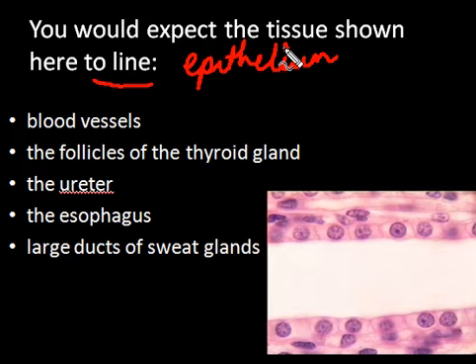You will be given questions. Most of the questions will say identify the type of epithelium seen here, or identify the type of connective tissue or cartilage or something like that. But occasionally you may get questions where it just says tissue, and there you have to look for clues in the question. So coming to this one, now this is epithelium, and first of course you've got to identify the epithelium to then choose which one of these is the right answer.